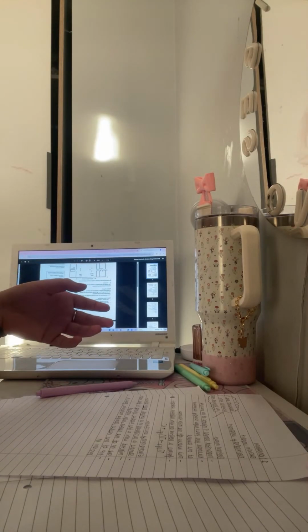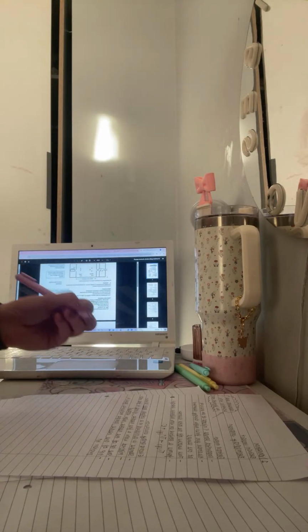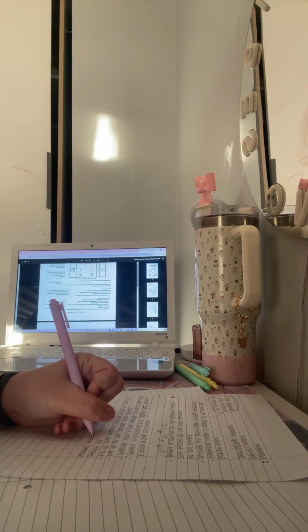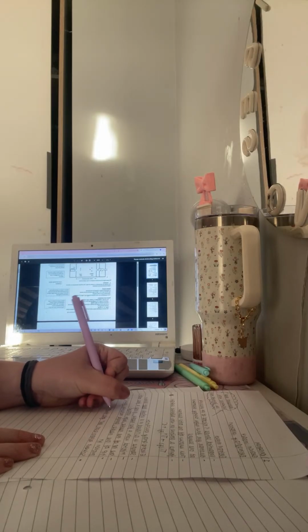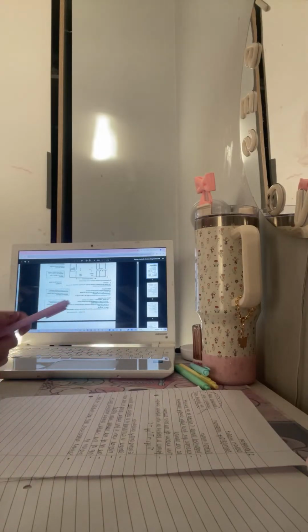The solvent evaporates, and the MH+ ions move towards the negative plate. That's the difference between electron impact and electrospray ionization.